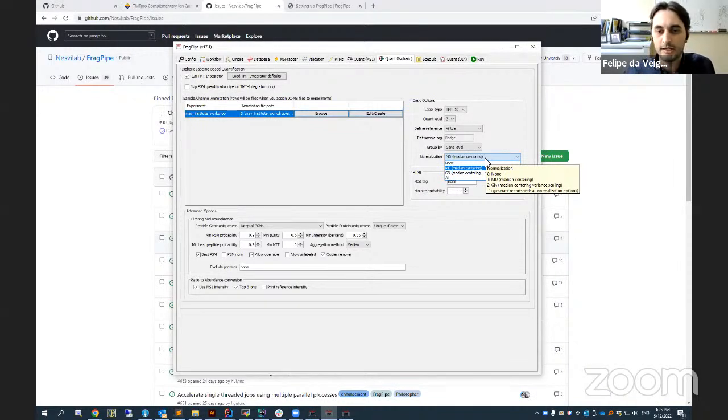If you want to get the details about the mathematics of the normalization, we can provide that. We have something on the website, but we are currently working on a draft that will explain in detail what's happening. So I guess, Fengchao, you can continue.